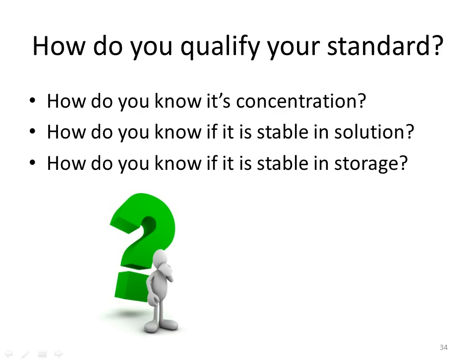So how do you qualify your standard? This is really important because, kind of like what Lindsay was talking about before, it's about how you analyze your data. If you use garbage analysis, you get garbage output. If you have a garbage standard, you have garbage data. And so how do you know its concentration? Honestly, I still don't know if there's a really good way.